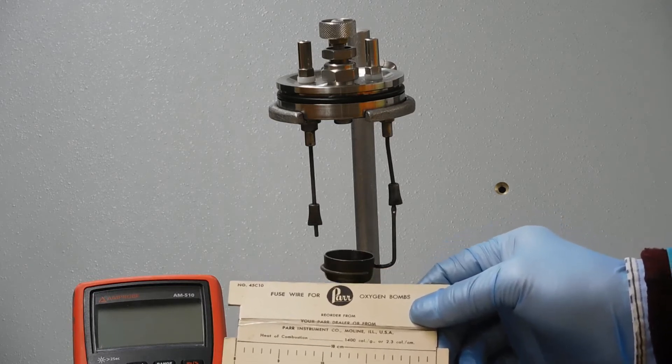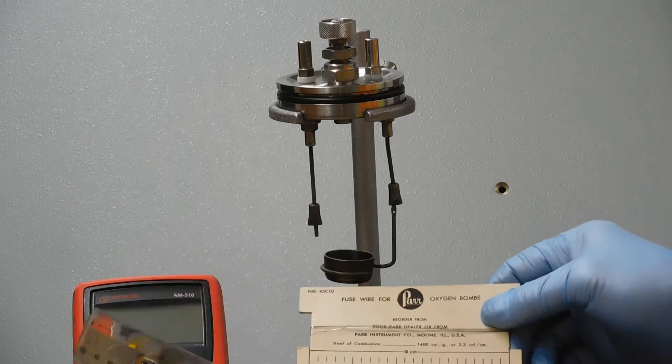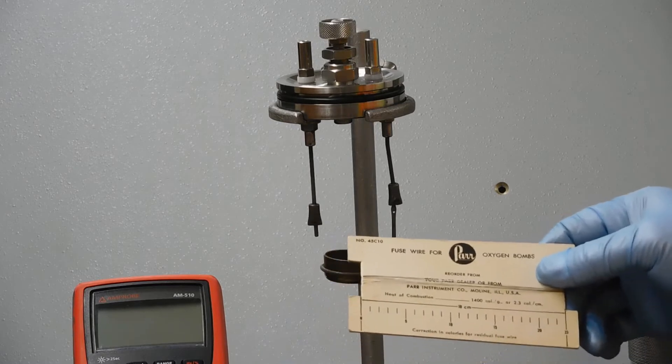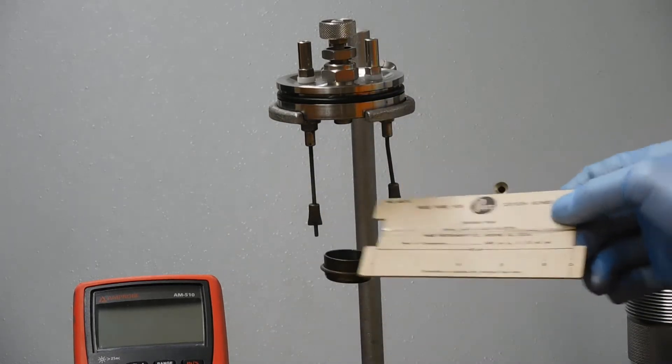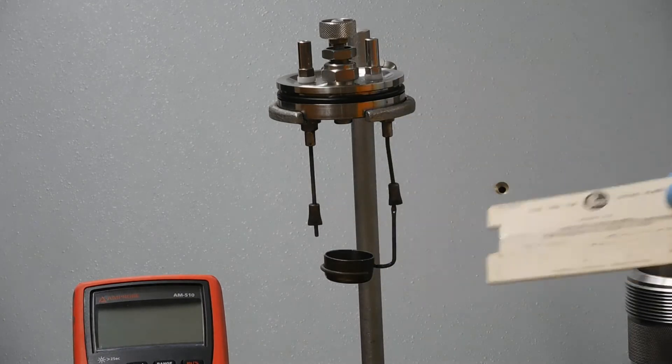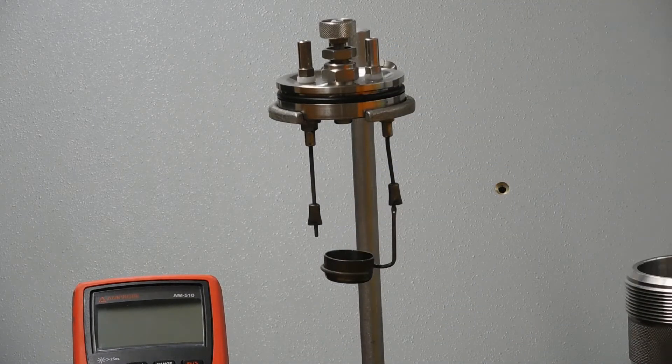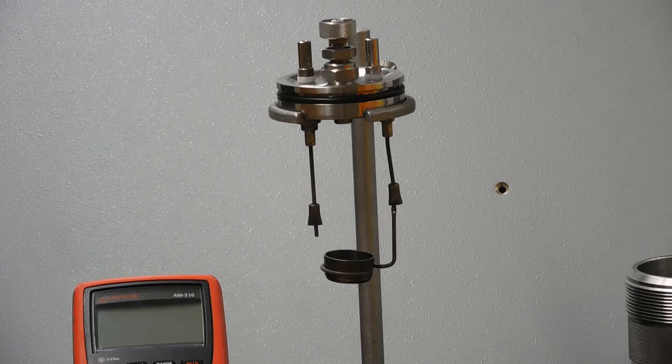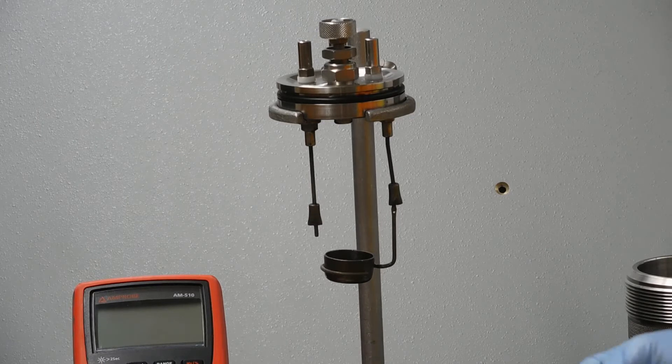You'll take this wire and measure it with a ruler, 10 centimeters of it, and cut a 10 centimeter piece off. Once you've got that 10 centimeter piece, you have to connect it properly to this holder so that the wire contacts both the electrical contacts and the sample you want to light on fire, the little pellet.